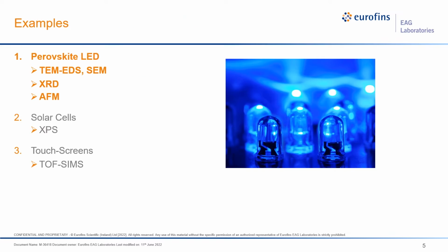I'll discuss these techniques in terms of sample applications. We'll start by combining imaging techniques with compositional and structural analysis in an R&D project for LEDs. We will then look at two types of chemical analysis, one for an inorganic film and another for an organic layer.